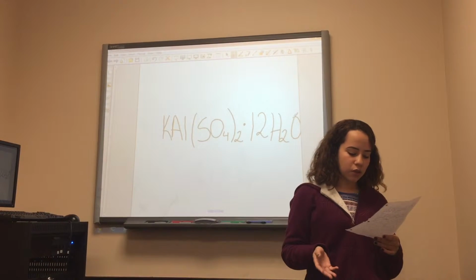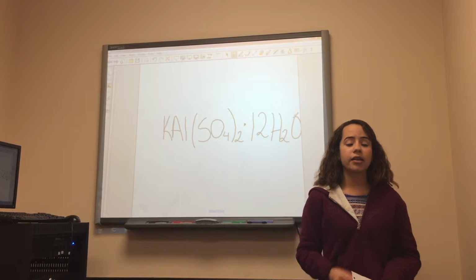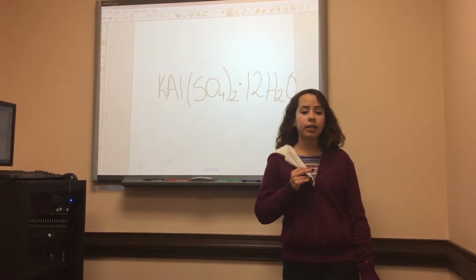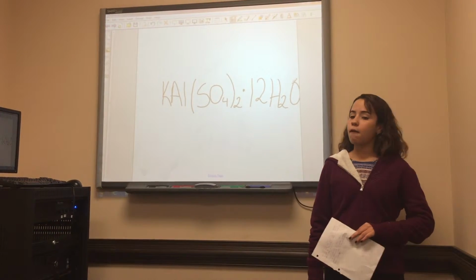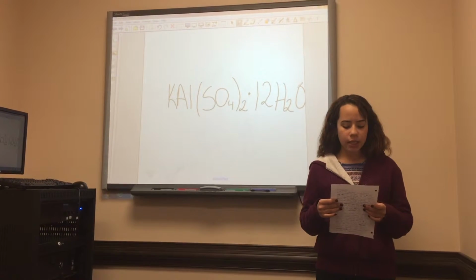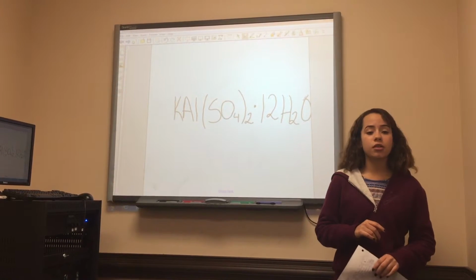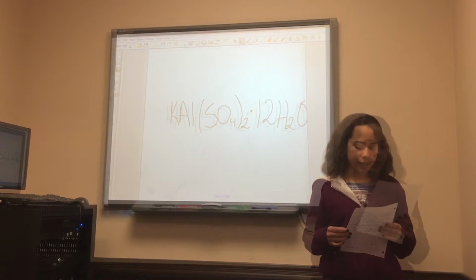And also in chemistry, aluminum foil is always oxidized to obtain aluminum ions. On the other hand, when the solution containing the potassium aluminum sulfate evaporates, we will see the formation of crystals from the compound mentioned before. After we finish with this experiment, we will keep the remaining aluminum because it's one of the metals that is very good to conserve, since it is considered very good for recycling.